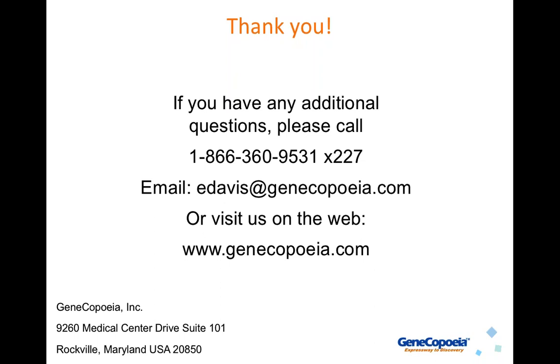Next question. If we select clones, shouldn't any progeny have the same mutation and in essence be a stable cell line? The answer is yes. If you've got clean isolation of a cell clone, then yes, all the progeny cells will have the same mutation. Although you can get recombination, you can get gene conversion if you only had single allele modification that would repair it to wild type. But in general, the answer is yes.